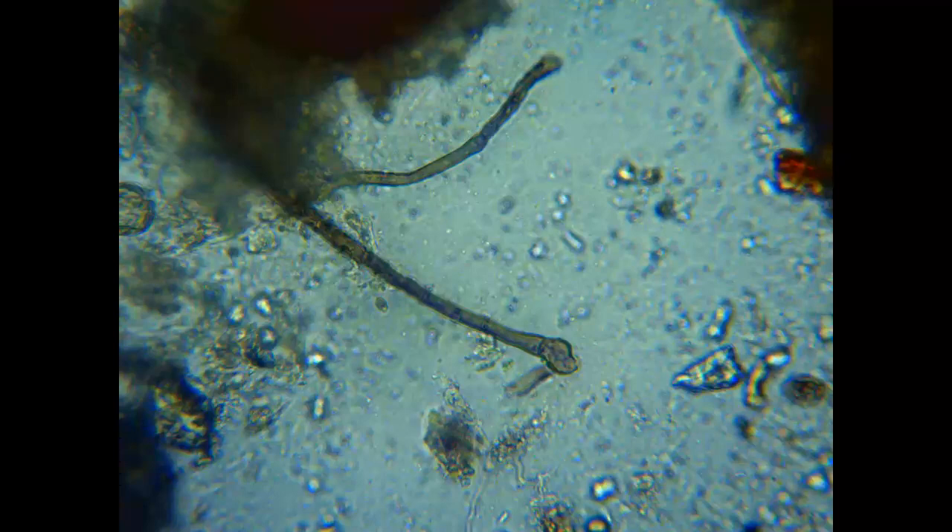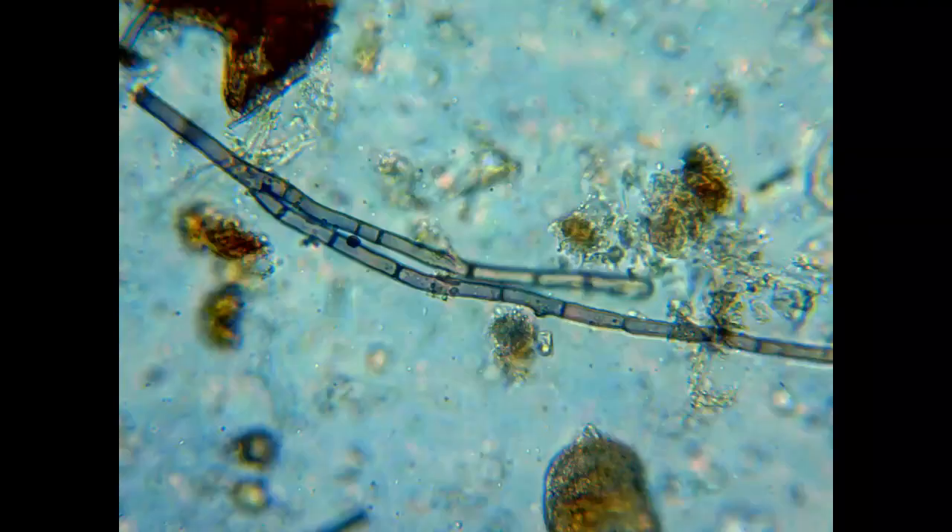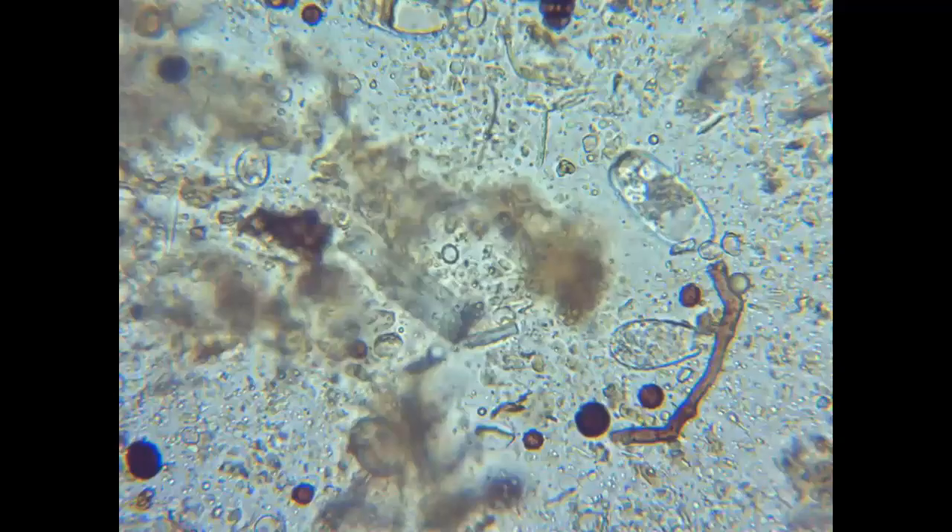One thing to note is that by using a microscope this way, you cannot determine if any of the fungi is mycorrhizal fungi. In order to do that, you'll need a special stain and a special microscope — you just can't do it with a regular microscope. You can also notice fungi spores. Sometimes they're just a single round object, and other times they look like a collection of these objects. These are potential fungi for the future.